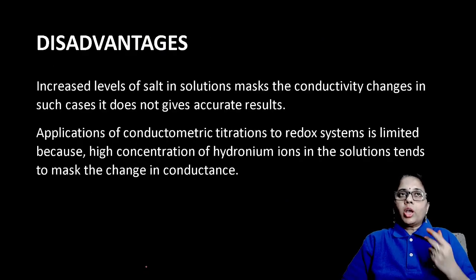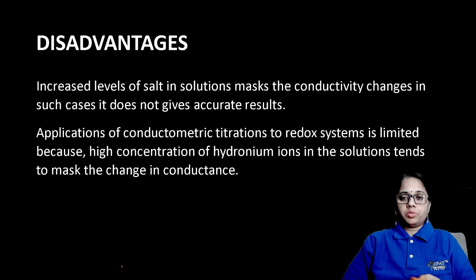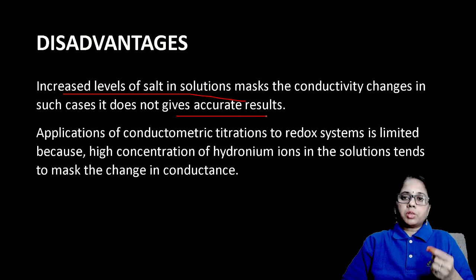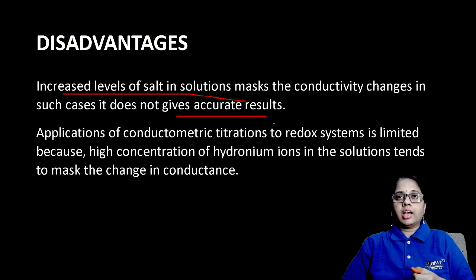Apart from the advantages, we have some disadvantages also. What are those? Increased levels of salt in the solutions mask the conductivity changes. In such cases it does not give accurate results. Some types of salts at high levels are going to mask the change in the conductivity.